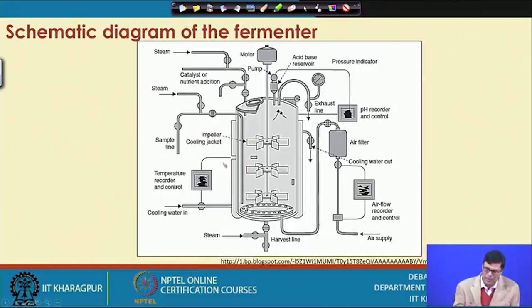And here you can use the sampling port. This portion is very interesting in the lab. How can we do the sampling?